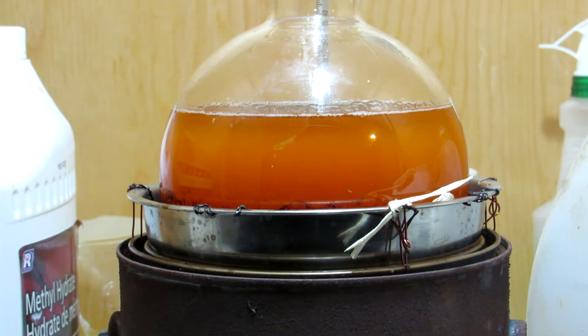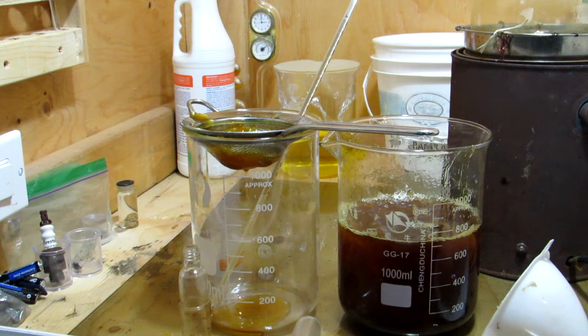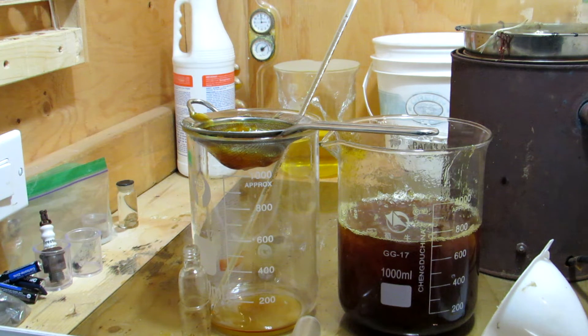The methyl esters produced can actually be used as biofuel, which is pretty cool. After an hour of heating, the heating mantle was turned off and the solution was allowed to cool. The air temperature was quite chilly, so after fully cooling, the upper methyl ester layer actually became gelatinous. This is expected as biodiesels jellify at higher temperatures than normal diesel, which is one of the challenges that biodiesel faces.